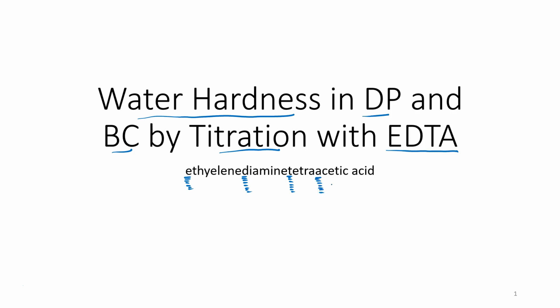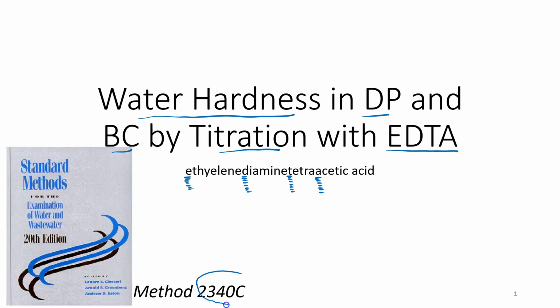And the method that we're using is actually a standard method. It's method 2340C. And a lot of our experiments this semester are going to be from this book of standard methods or EPA methods. So if you go on a job interview and they ask you, do you have any experience either with standard methods or EPA methods, you could say that you have some.